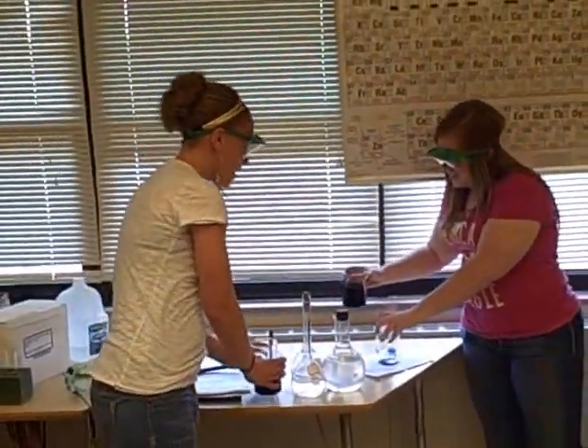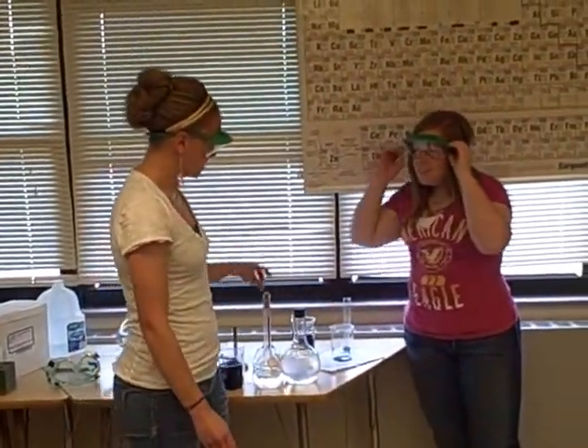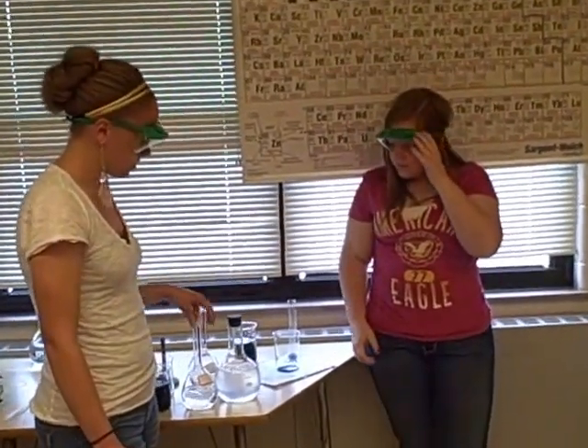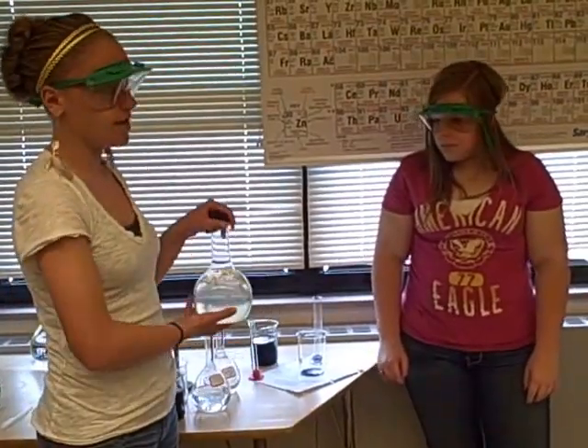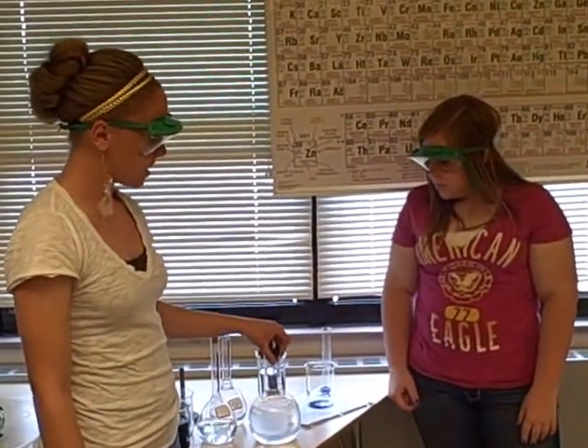What happens with this is that the potassium iodate combines with the sodium metabisulfite and leaves behind the iodine, and then the starch that we made serves as an indicator, which is what turns it that color that fast. Pretty simple experiment.